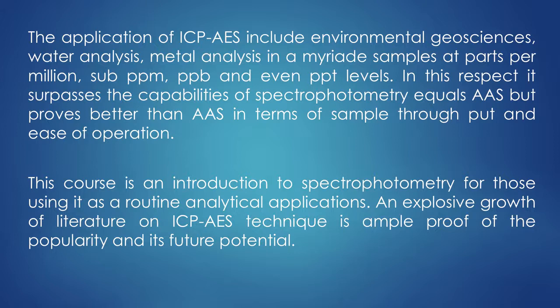The applications of ICP-AES, as I told you earlier, include environmental sciences, geosciences, water analysis, and metal ions in a myriad of applications and samples, at parts per million, parts per billion and parts per trillion (PPT), that is 10 raised to minus 12 grams analysis.